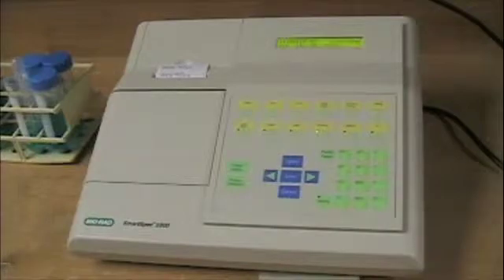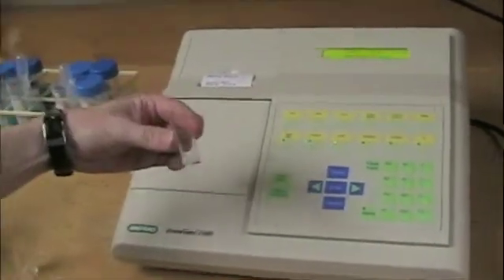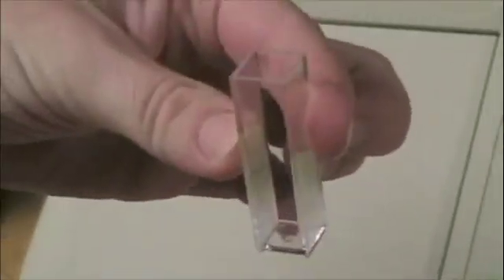First thing to remember when we put our samples in: we're using a cuvette. This is one of the cuvettes — it's plastic. There is a clear side and a stripey side, and we always put it in with the clear side facing us. The cuvette goes into this cuvette hole right here. We put it in, close the door, and then we can read our sample.